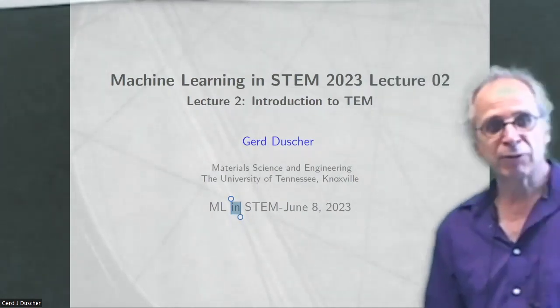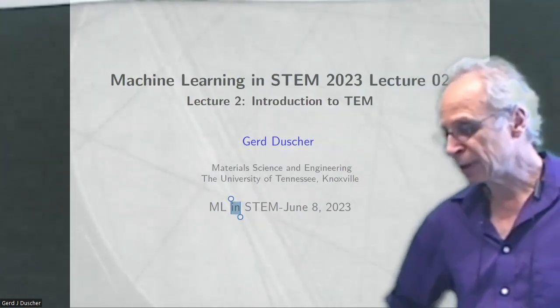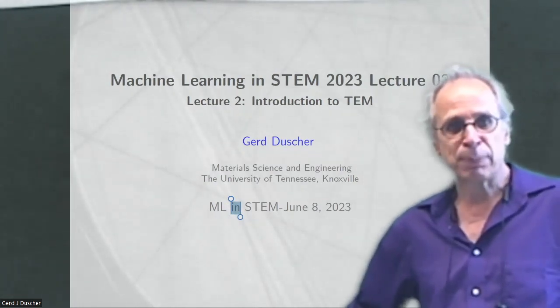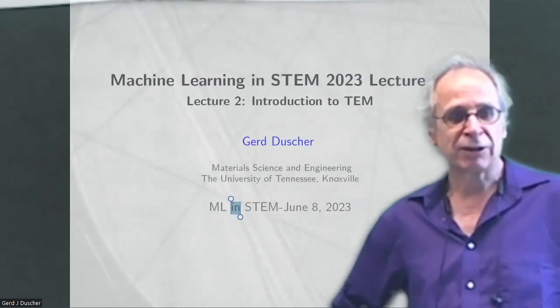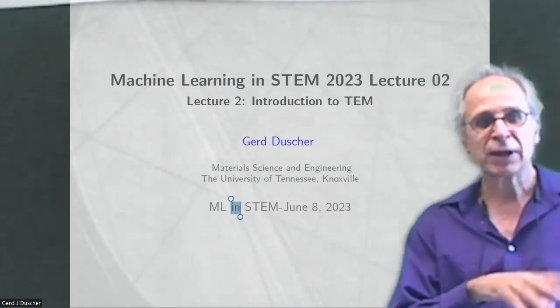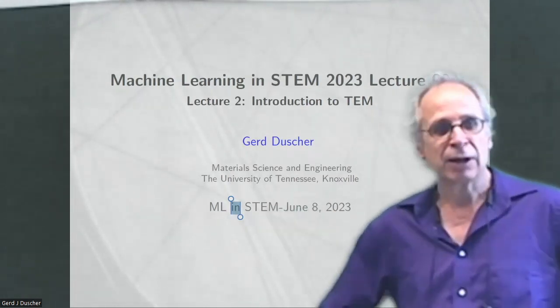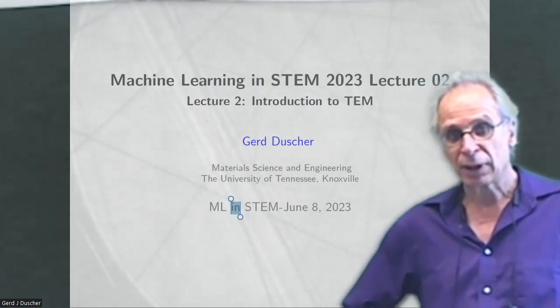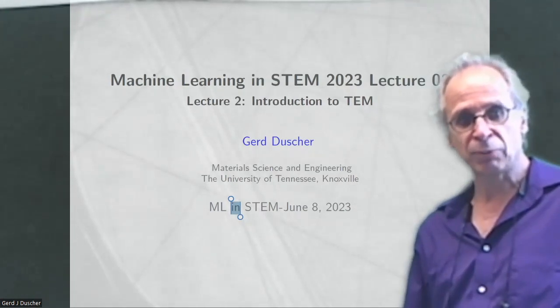Okay. Good morning, everybody, to this machine learning in STEM lecture series. Today, we want to cover the basics of TEM. Most of the lectures are actually really about learning the language. So if you're in machine learning, you have to understand what the people who are microscopists are talking about. And so today it's mostly a language course, actually, really a language course in terms of microscopy.